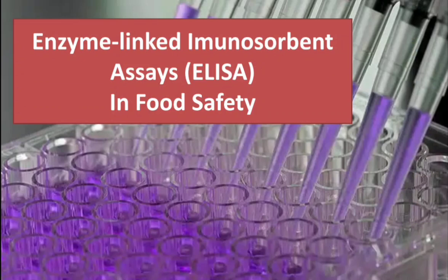So today in this lecture we are going to understand ELISA as it is used in food safety, or you can say ELISA's application in the food industry, what ELISA is, what the different types of ELISA are, and how ELISA works in the safety of food and food-based products.